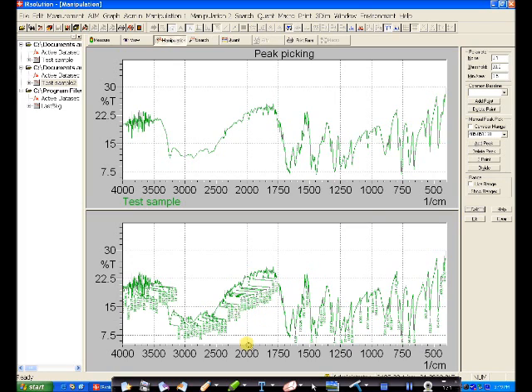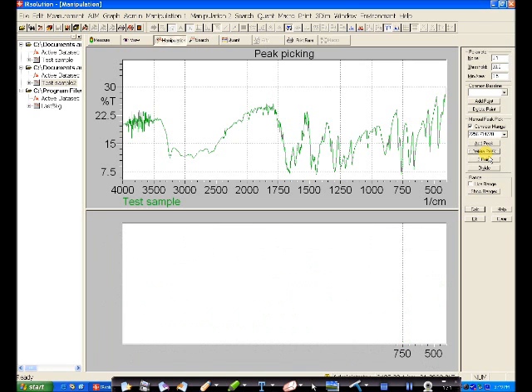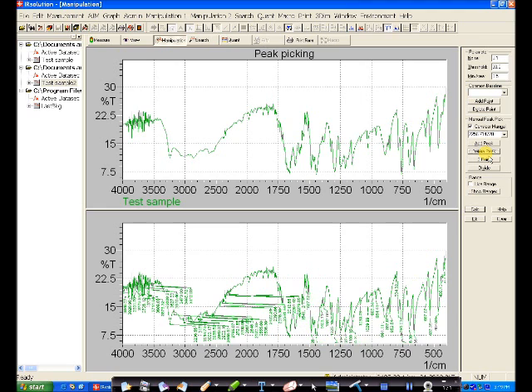You see that your chart right now is a little bit congested. There are just too many peaks that appear and you don't want them to be shown. What are you going to do? Look at my cursor on the right hand side, this is Manual Peak. When you click onto the drop down box, you can choose the ones that you do not want and delete. Once you're happy with the number of peaks that you have, you can press OK.